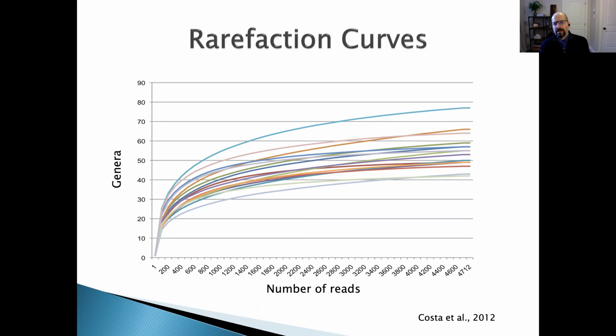So there is another type of analysis we do that we call coverage analysis. That's going to tell me that with this subsampling, with 4,700 reads, you have found around 99% of all the genera present in that environment. Meaning that if I carry on spending money and analyzing more and more DNA strands, I'm not going to find a whole lot more genera there. Okay, that's it. It was good.